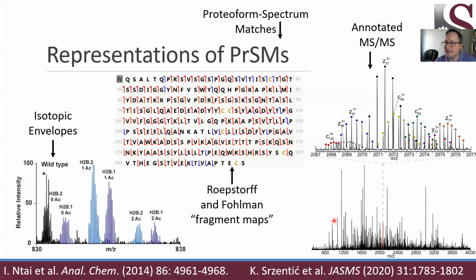Here we are looking at a tandem mass spectrum. So this image that we see at the bottom has a range from about, say, 700 m/z up to about 4,000. And we see that it's just littered with different fragment ions. Over here, we're looking at intact proteoforms. Over here, we're looking at the fragments produced from a particular proteoform. Okay, so this type of spectrum looks like a very complex lawn. You wouldn't want to mow that.